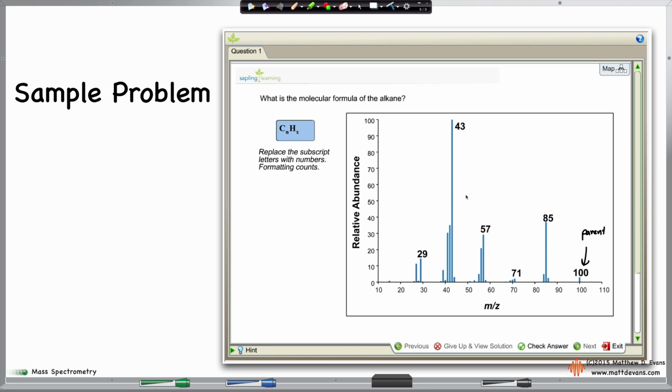I don't know if there's really a good method out there for figuring out what this chemical formula should be, but the good news is there's only carbon and hydrogen. We don't have to worry about oxygen and nitrogen and all this other funky stuff. So I'm just going to take a guess. I think there's probably 7 carbons in this. So I'm going to assume 7 carbons times 12 is 84, and that means there must be 16 hydrogens to get to 100.